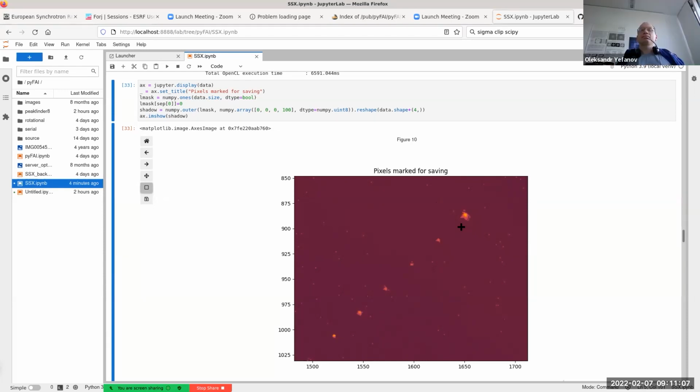Having all this computation offloaded to the GPU frees CPU resources to perform the image reconstruction, the frame reconstruction, to be precise. And then frames are grouped in larger chunks in order to perform the pedestal correction also on the GPU. So those larger chunks are sent to the GPU. The computer we are using is an IBM Power 9 server, which has a very large bandwidth between the CPU and the GPU.